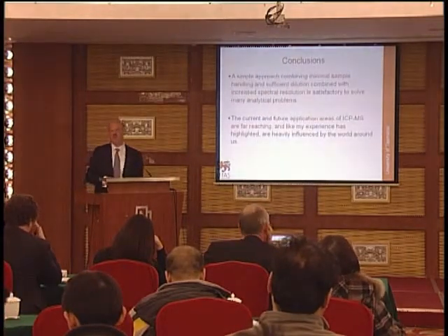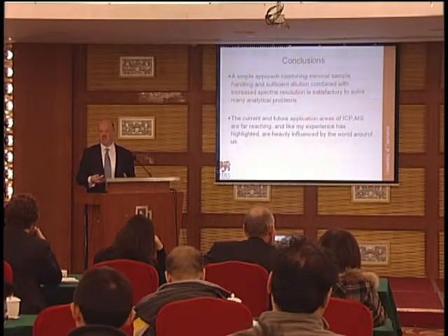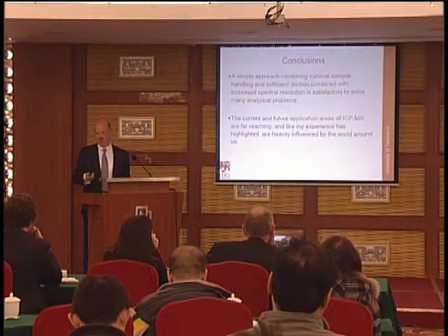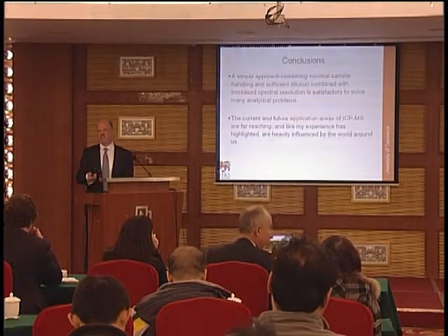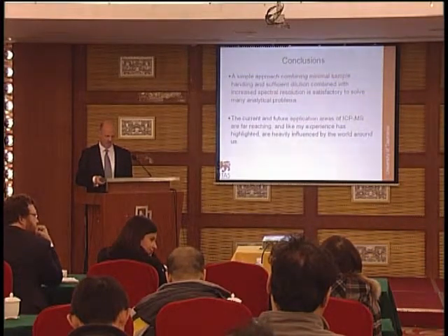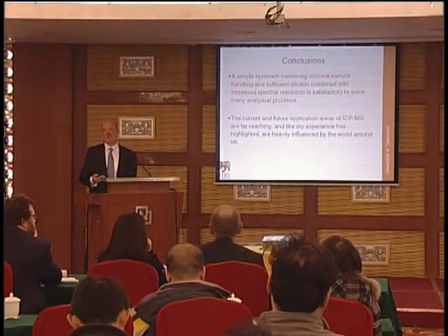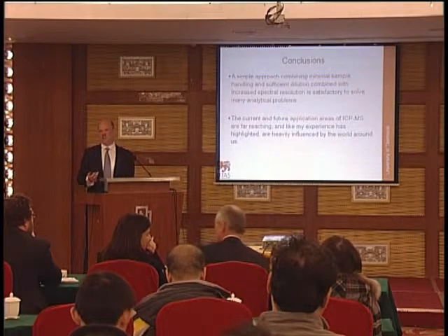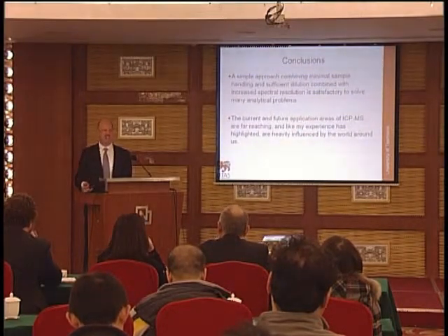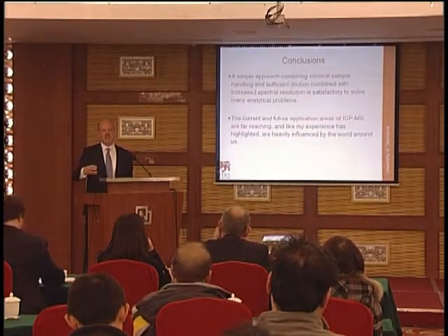And my approach, my sort of philosophy of doing things as simply as possible, handling the sample as least as possible, as least times as you can, simply diluting it, analysing it in combination with increased spectral resolution, is really a fairly satisfactory approach to solve many problems. And the application, I mean, this is probably where I'm coming from. If you get nothing else from my talk, there are lots of applications right outside our back door that we can apply our techniques, no matter what they are. They're just waiting to be discovered. Just like that whale poo, it's just like a new approach.